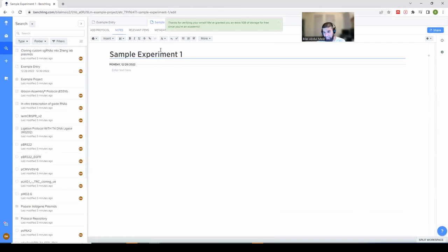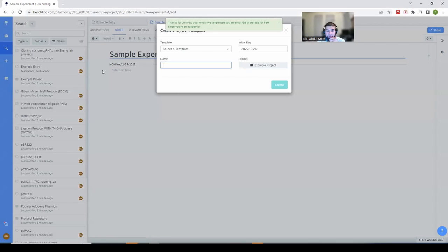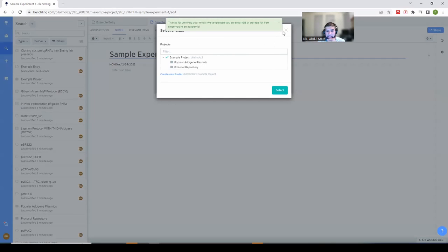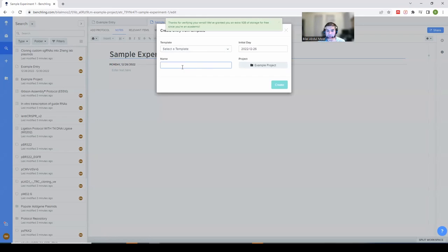Under Create, you can set up a new project and use templates, which I'll get into later. Let's start with a blank entry — we'll call this 'Sample Experiment One.' You'll notice it populates the date automatically based on the current date. Keep this in mind if you've set up a template with multiple dates, like a 10-day experiment. If you're entering it a day or two late, you need to set the correct initial date, which you can do when creating from template.